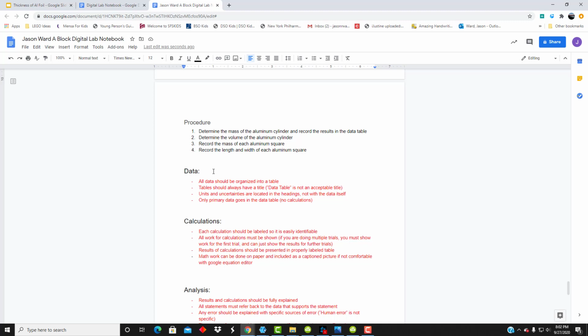First of all, it saves time. When you're doing the lab, you have some place to put the data, keep it organized. It also helps you make sure you know what it is that you need to do, what are the data points that you need to gather in the lab, because if they're in the table, you need to be able to fill them in.